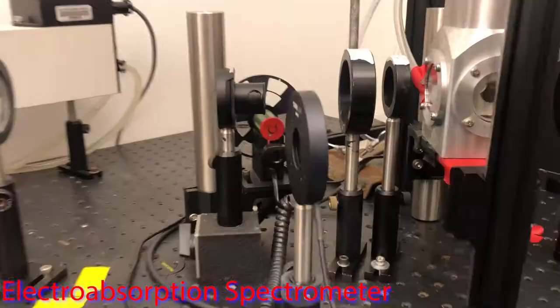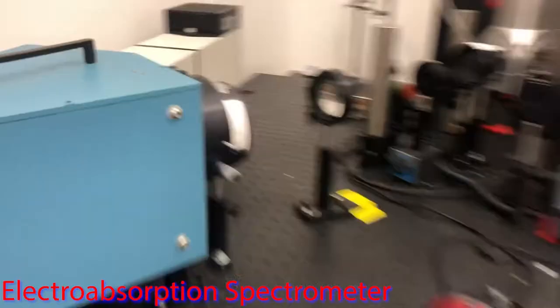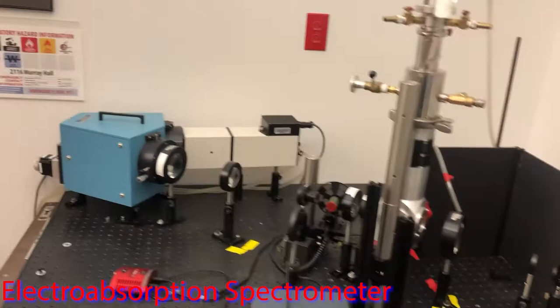This here is a fairly custom spectroscopy apparatus. This electroabsorption spectrometer allows us to measure changes in a molecule's absorption spectrum in an applied electric field. This allows us to determine fundamental values such as the change in dipole or change in polarizability associated with an electronic transition.